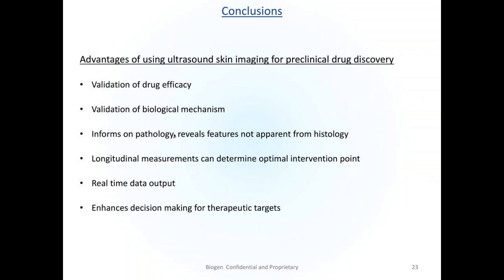Until we'd seen those images and seen that extra dark band region, we really hadn't appreciated that extra tissue layer was forming. So ultrasound was able to enlighten us about things that we may not have appreciated before, just because our histology might have been selective to certain regions.